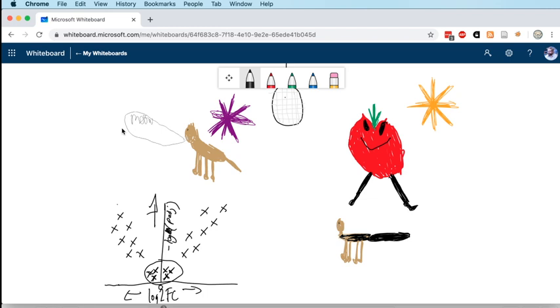In order to produce that, we want, for every gene that we have analysed, a fold change and a p-value. And we have that data because we have it in one of the several data frames that we produced yesterday. We want it for every gene. So let me dispose of that.